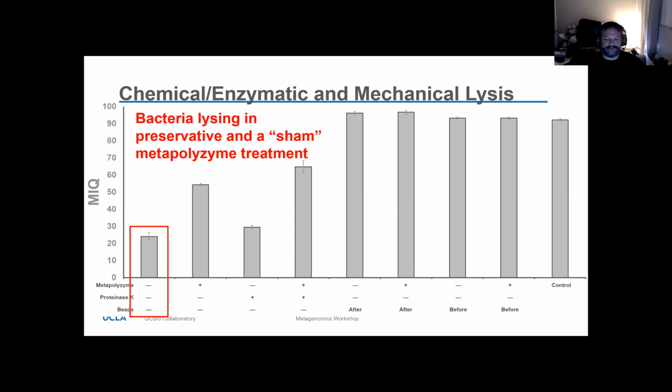physical methods like beads, and I'll talk about those at length, have a tendency to shear DNA, which isn't a problem if you're doing Illumina sequencing, because your Illumina fragments are small anyway. They're usually a few hundred bases. But if you're trying to go for nanopore sequencing, where you want hundreds of thousands of bases if you can get it, beads tend to be a bad option, because they're going to limit your read length.